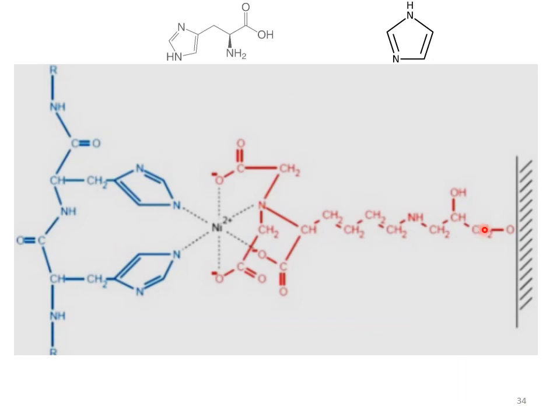So here, this is the stationary phase. The stationary phase is made up of agar beads or agarose beads, and it contains a functional group on it. And associated with these functional groups are the nickel ions. So the nickel ions are immobilized onto this stationary phase.